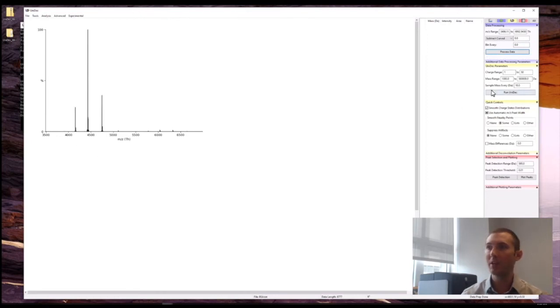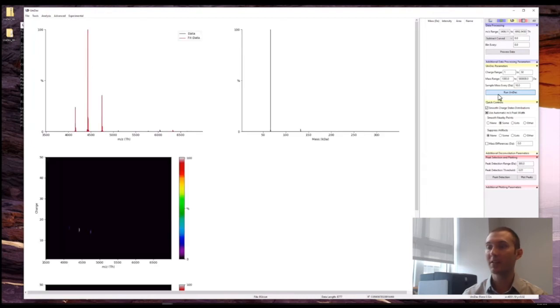Okay, the next step is to just simply run UniDec. From the default deconvolution parameters, we're just going to hit run and see what happens. You can see it takes about a second to run the deconvolution. It looks like 0.5 seconds here. It takes a few seconds to plot all the results, but it's pretty fast, right? We've done a really high resolution scan, deconvolved it really quickly.